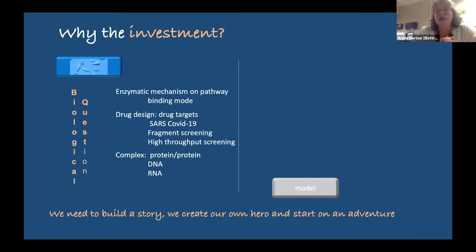They can look really good and they can diffract really badly. So you just never know. You need to go to the synchrotron and test them. So this is a big process, a huge investment. If you think about diamond crystals, they are really cheap compared to the cost of making these crystals.